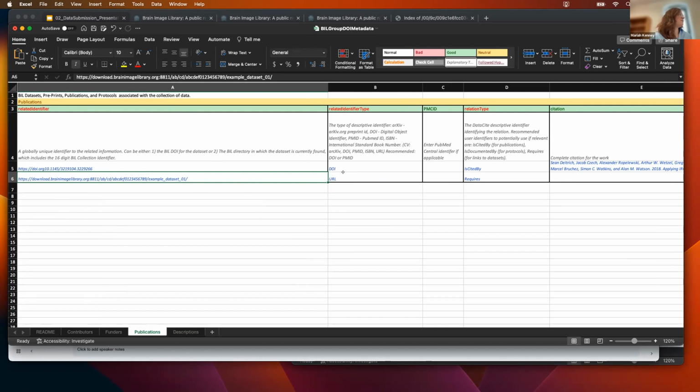If you ever have questions about what to include here, or finding the links for the data sets that you've put in, you can reach out to the help desk and say, I want to include all of the data sets from these three submissions. That's fine by me. I can help you create a list of all the data sets that you have and really fine-tune that to see exactly what you should include.